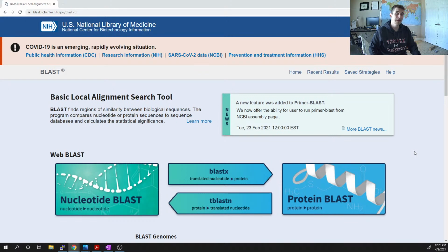It very well might be not the oldest tool. It's close. This was produced in 1991. And even though it's 30 years old, it's still probably the most commonly used program in bioinformatics. Almost everything starts with BLAST. And almost any time we're going to annotate a gene, almost everybody will use BLAST to do it. You'll see some variation around it, but 95+% of the time, we're going to use BLAST to do this.